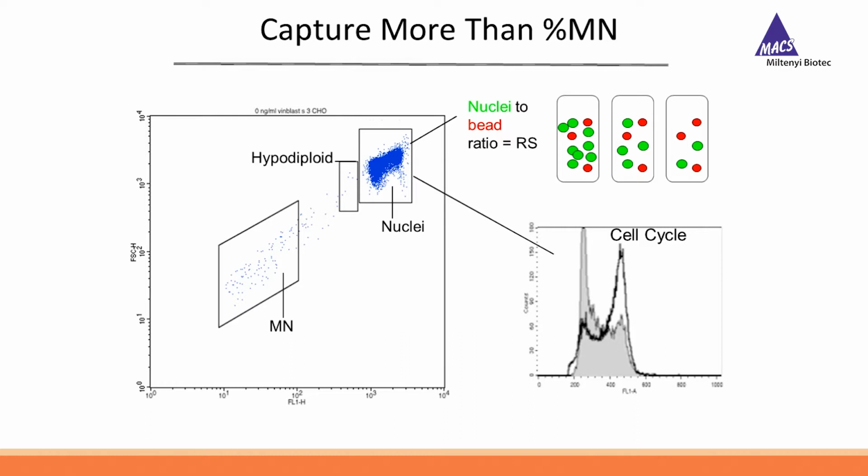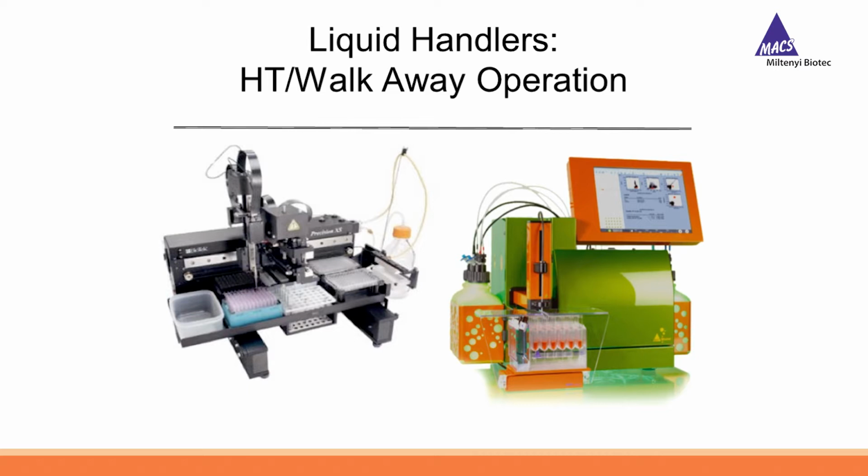If you're familiar with the assessment of genotoxicity for regulatory studies, you need to have a very good indication of cytotoxicity, because those two things go hand in hand. Genotoxic compounds are by nature cytotoxic, and therefore you need to control that very well in order to dial in the assessment of genotoxicity rather than just looking at frank cytotoxicity. So we get all of this information, and that's a lot for a single cell, but we've increased the ability and the efficiency of the assay to give you not only lots of information about a single well, but lots of wells across a single study.